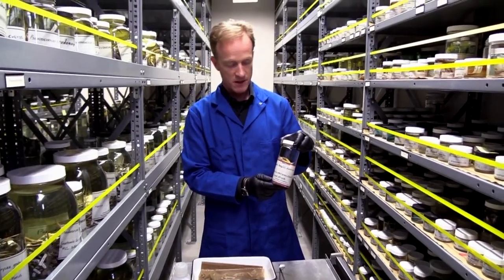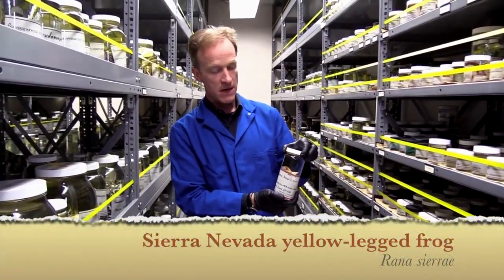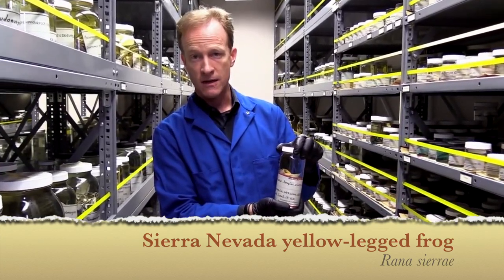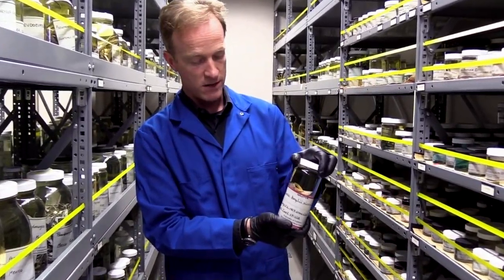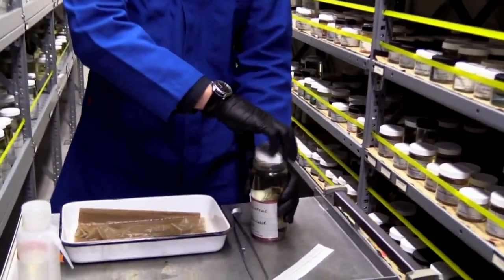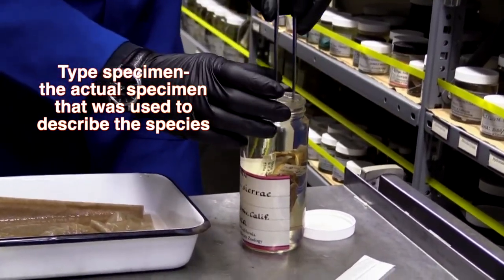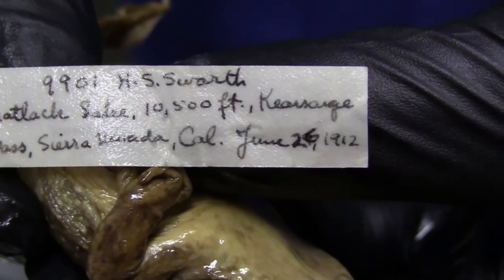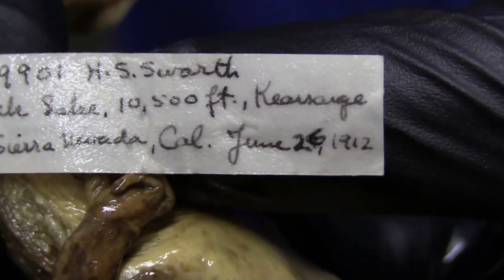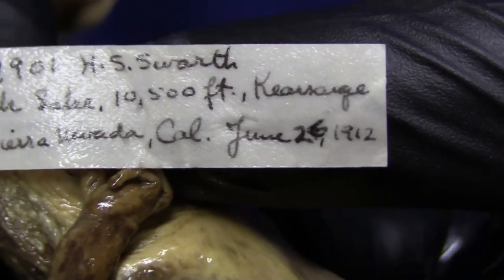This is a very special specimen. It's called Rana sierrae, which is our Sierra Nevada yellow-legged frog that lives in the mountains in California. I have to be very careful with this because it's actually the specimen that describes the species — it's called the type specimen. Here's the original tag from the frog: collected June 26, 1912, at Kearsarge Pass, California, 10,500 feet.